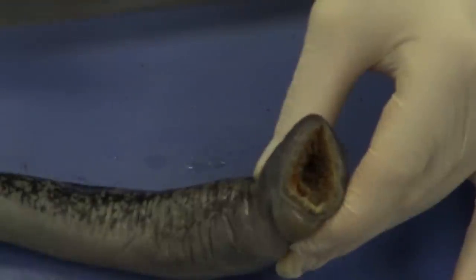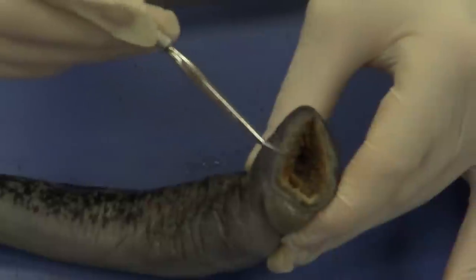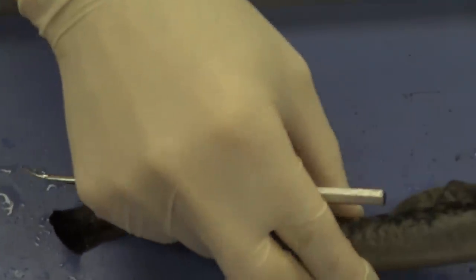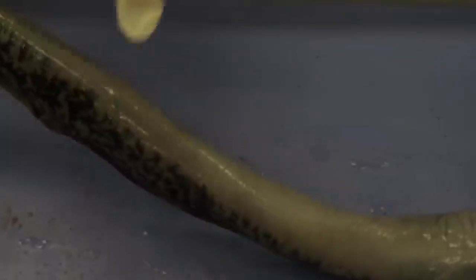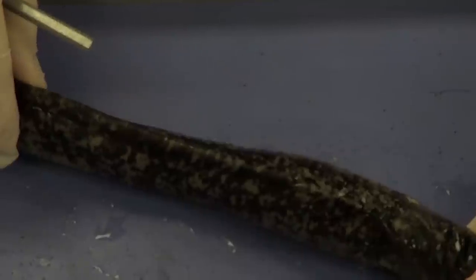Before we go further, let's talk about anatomical locations. This is going to be the mouth, so this is the anterior aspect of the lamprey. If we go down to the other end, this is going to be the posterior aspect. The back of the fish, which is where the fins are located, is going to be the dorsal aspect — that's why these fins are called dorsal fins. And opposite that, on the belly side, is going to be the ventral aspect.